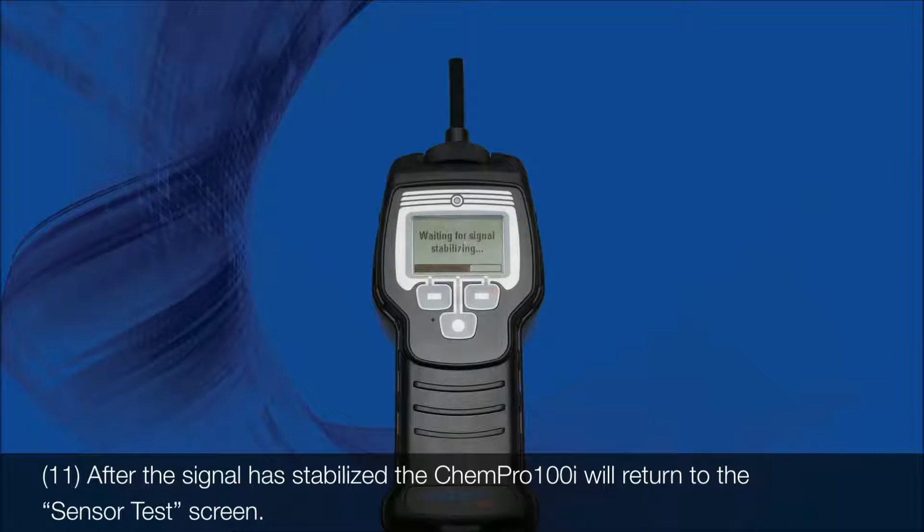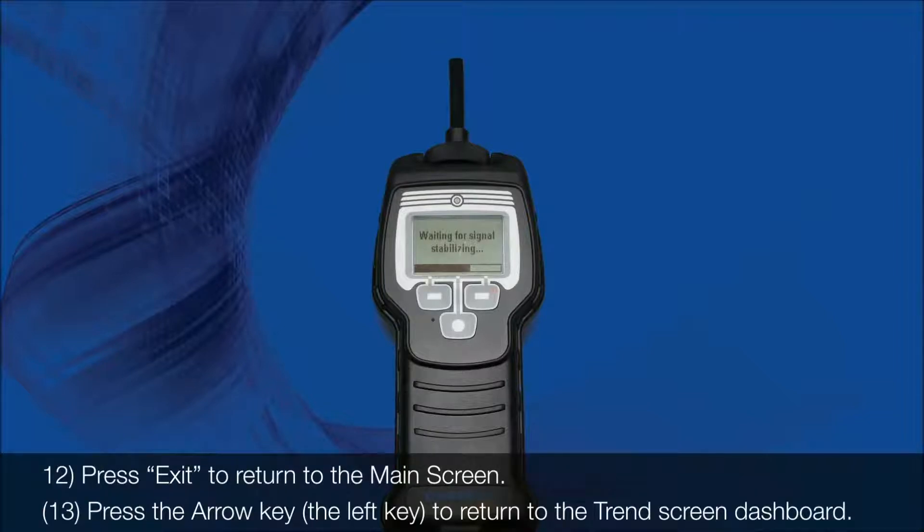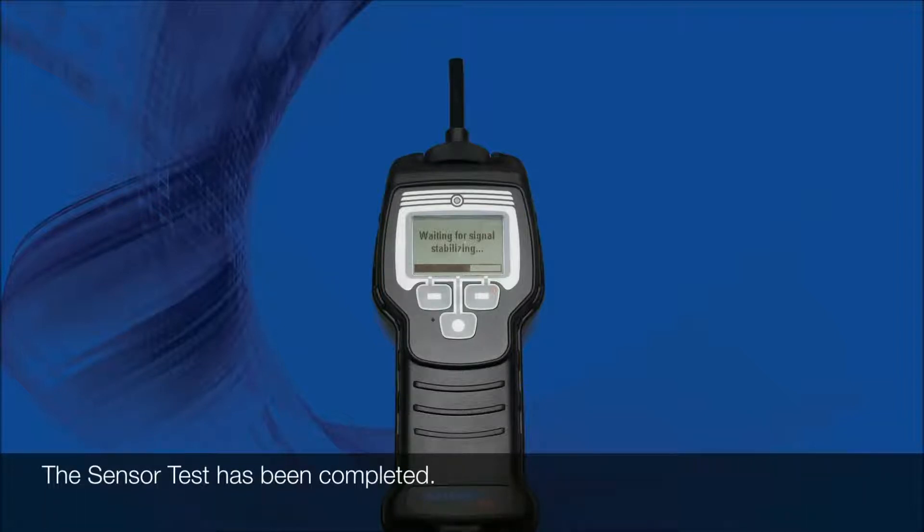11. After the signal has stabilized, the Kempro 100i will return to the sensor test screen. 12. Press exit to return to the main screen. 13. Press the arrow key, the left key, to return to the trend screen dashboard. 14. The sensor test has been completed.